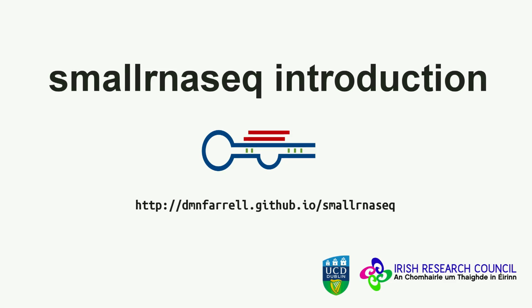So this is a video about how to use a Python package called smallrnaseq to analyze the short non-coding RNAs present in short read sequence data, that is usually FASTQ files. And this video will concentrate mostly on how to use the command line interface, which is designed to be flexible but relatively straightforward to use.